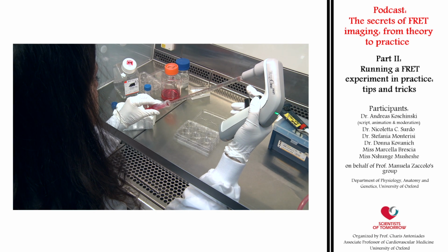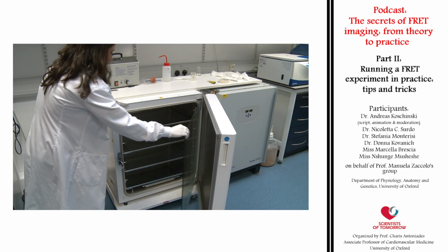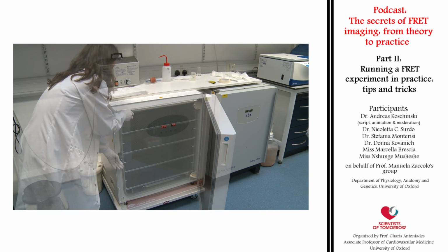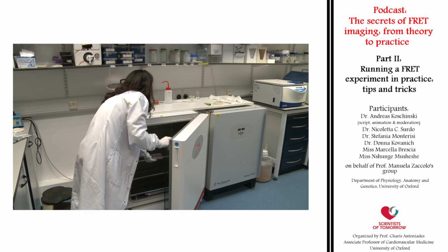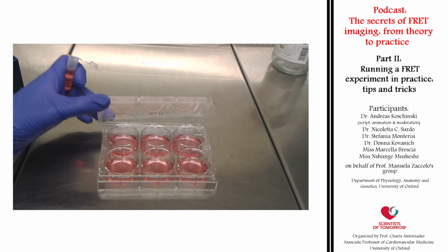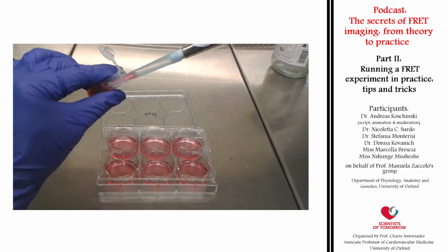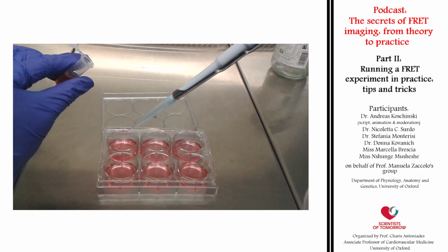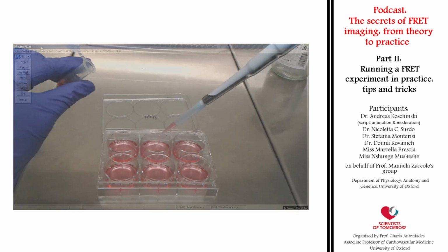In our experience, seeding about 600,000 myocytes per well yields good results. Then put the cells back into the incubator and let them settle down for about 24 hours. After this period, the cells are ready for transfection with your FRET sensor using the transfection protocol of your choice. After adding the transfection mix to the cells, it usually takes another 24 hours in the incubator until they express the sensor adequately. Typically, we measure the cells 24 to 48 hours after transfection.